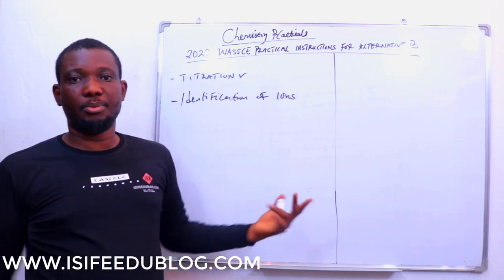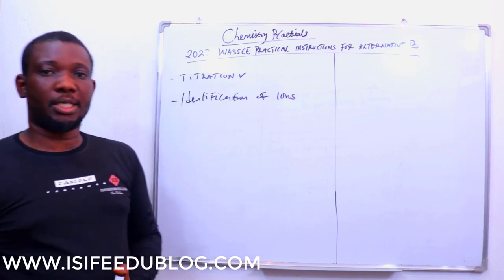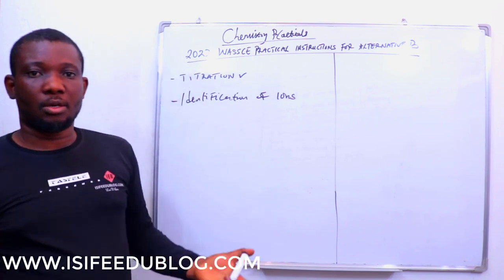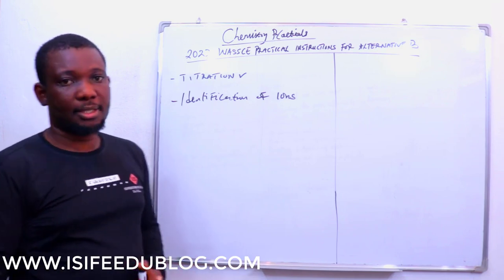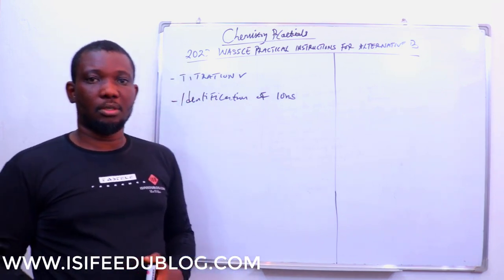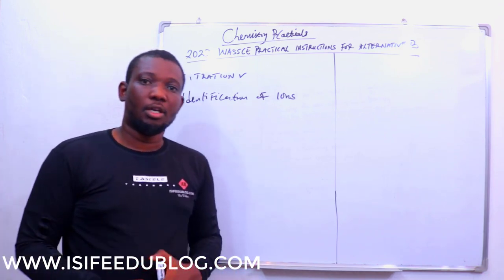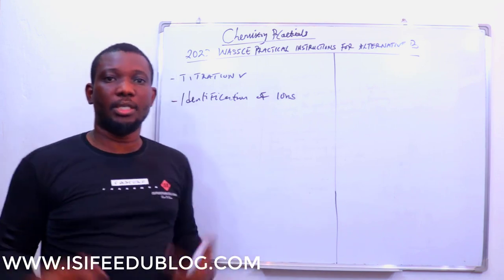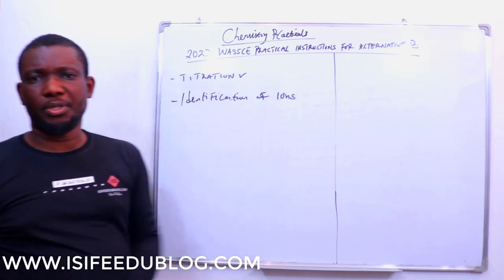Because if your table is incorrect, then what you are solving in question 1, part B, is going to be useless. So make sure that table is very unique. Make sure it does not look like you copied from your neighbor. Make sure it looks like you actually did the experiments. First, we start with the question.